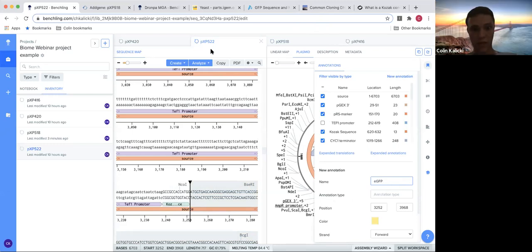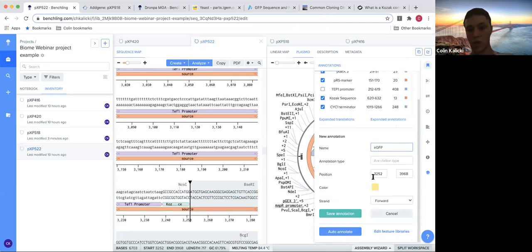Is it a sequence without introns or exons? That's a good question. A lot of times the one I just got is just modeled for eukaryotes specifically, so they kind of already did that work for me. But if you were to try to model this protein by yourself, that is something you're going to have to care about quite a bit. So let's say maybe you wanted introns in there, you knew how they're going to get removed. You could maybe model it for that. This one's probably without introns. They probably just are coding for the exons.